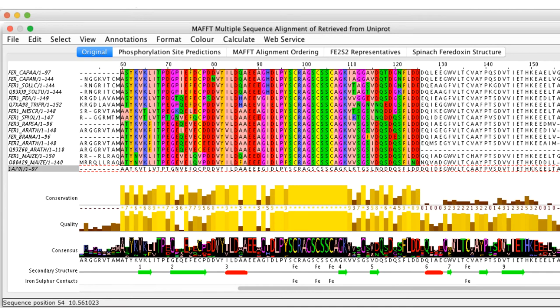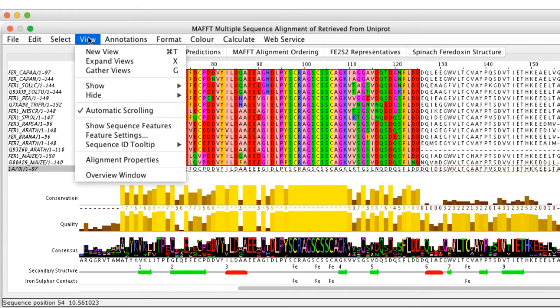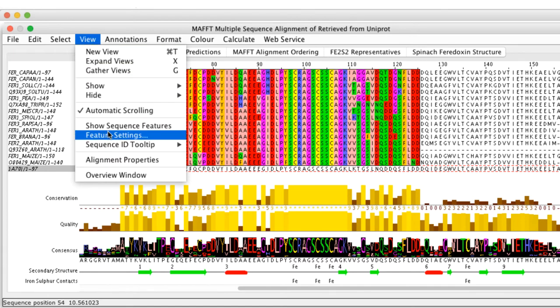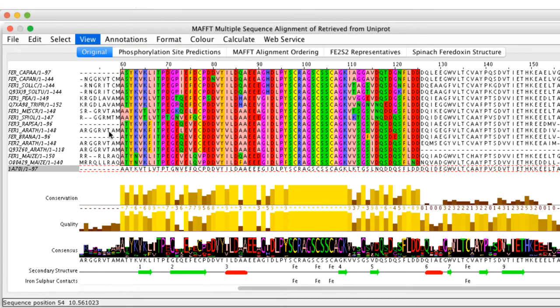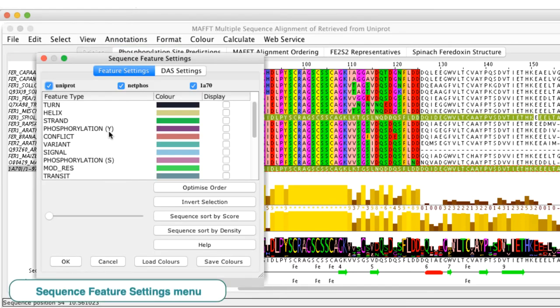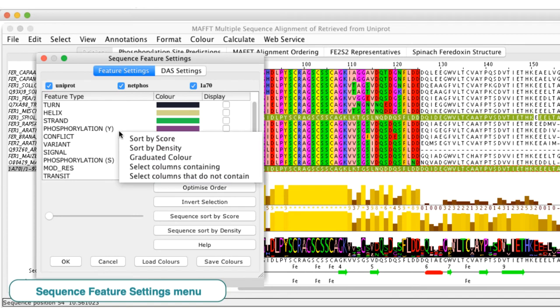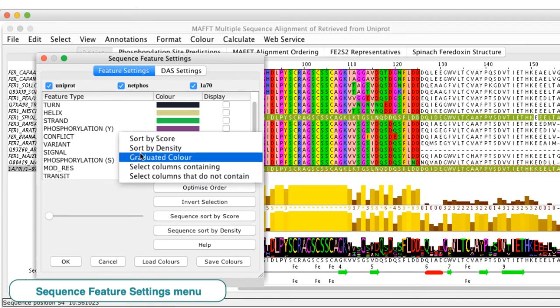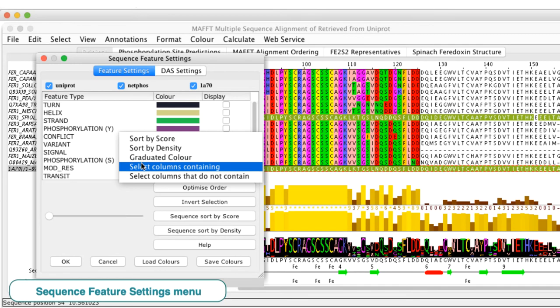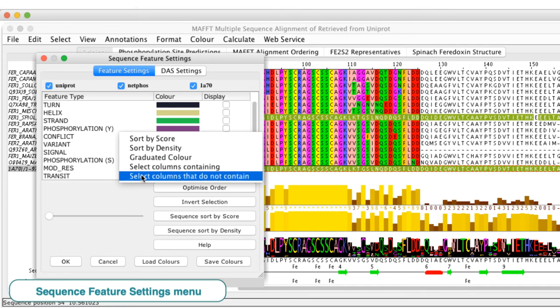The context menu of the feature settings dialog window can be opened by going to View and selecting Feature Settings. Then place the mouse in the Feature Type section and right-click the mouse to access a variety of sorting, selection and color options.